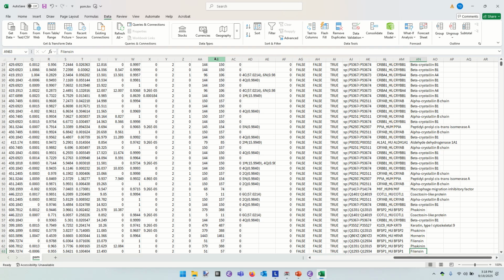All right. Are there any other questions about PTM hunting? Well, I really appreciate your taking some time with me on a Friday afternoon. Chris, you had a thing to say. I was wondering, there is a separate workflow for glycoproteomics. But what would the feasibility be of doing an open search that includes modifications up to large glycans, which can be like thousands of daltons?